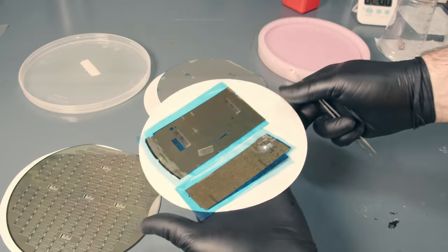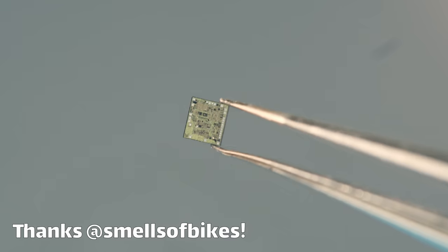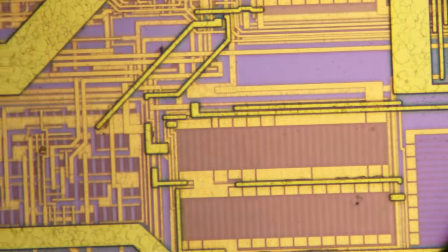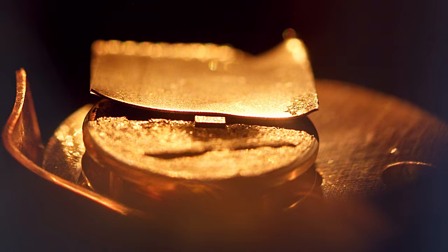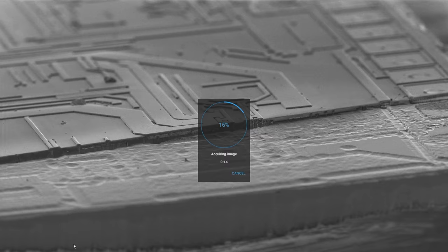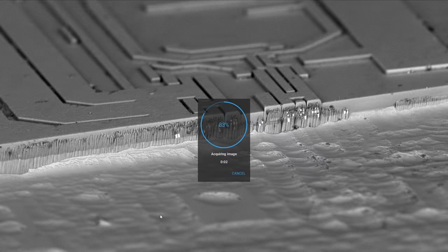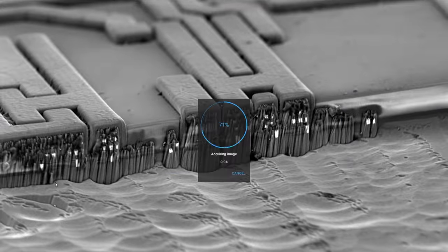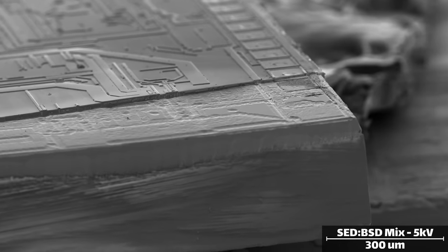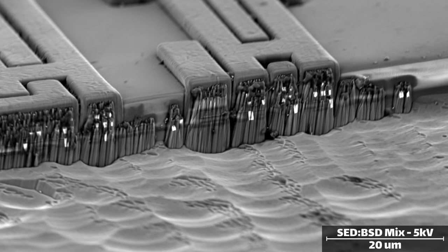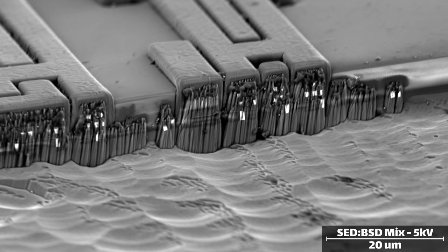To demonstrate this in practice, I etched some of these microchips that were kindly donated to the channel by a viewer. A thin piece of titanium shim stock was used as a mask, and it was etched in the machine for about an hour. And goodness, does this look really cool under the microscope. We can see a very clearly defined etch line, and zooming in we can basically see like a cliff or a wall where the mask hid the material from the ion beam. I was etching very aggressively to remove material quickly, so we can see that the etched region is filled with craters and pockmarks.